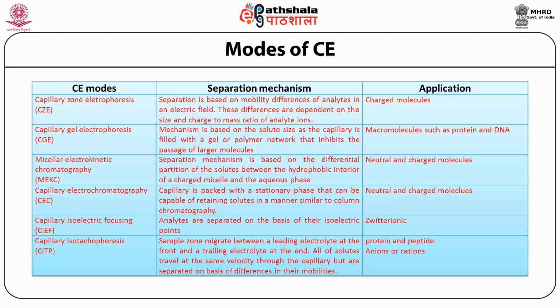In electrophoresis, a mixture of different substances in solution is introduced, usually as a relatively narrow zone, into the separating system and made to move under the influence of an applied potential. Due to differences in effective mobility, and hence migration velocity, of different substances under an electric field, the mixture then separates into spatially discrete zones of individual substances after a certain time.